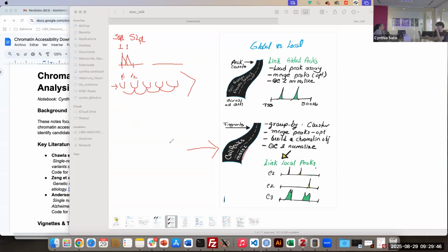CellRanger has a wrapper for MACS2 where we can say that the peaks counted need to be specific for each one of the samples, but also for each one of the cell types that we have detected. So when I'm running the peak calling function here, what I'm telling the command is that we want peaks that could separate the different clusters that I have in the data structure.